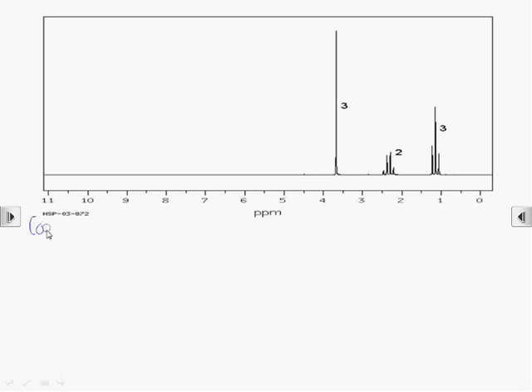To interpret an NMR spectrum, we need to use a method that will help us to be systematic.